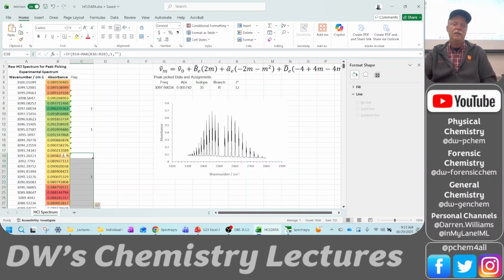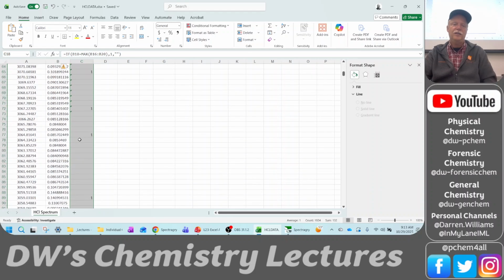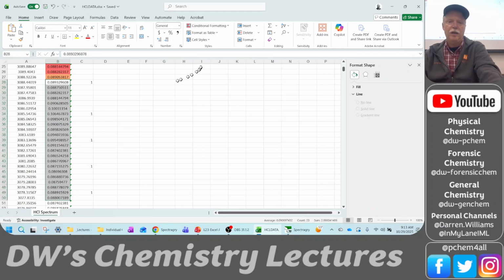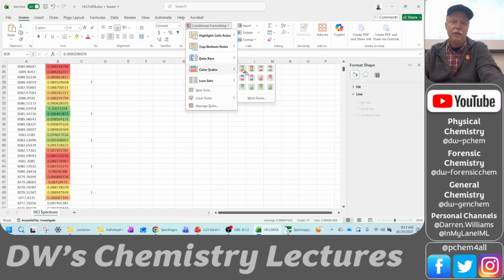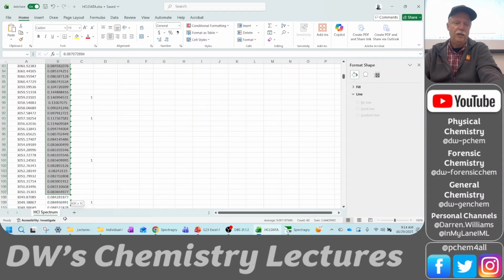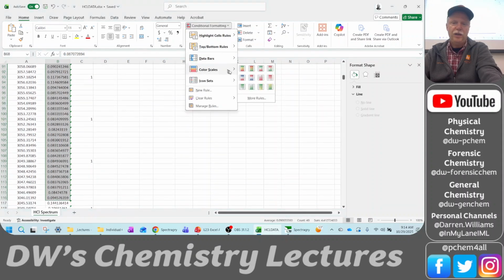I can double click this and go down and see all of these places where there's peak maxima. Now I still want to check these with the conditional formatting, because some of these may be false. So I'm going to do conditional formatting, at least for the weak peaks. I'm going to do a few panels here and there, and then I can do the full middle range. It looks like it's picking up peaks, but this one is not a good one. So this is a fast way to go through and find your peaks and pick them.